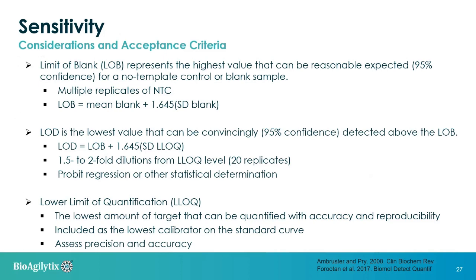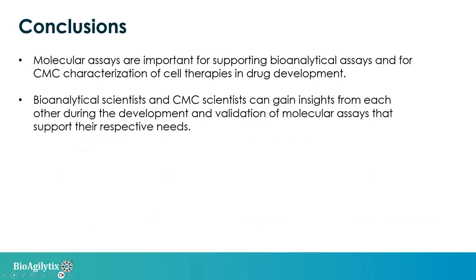And with that, I'm going to conclude with just hoping that you take away that molecular assays are important for supporting bioanalytical assays and also for CMC characterization for cell therapies and drug development. My colleague Shishin and I talked a lot about the different assays that can be used in this space.